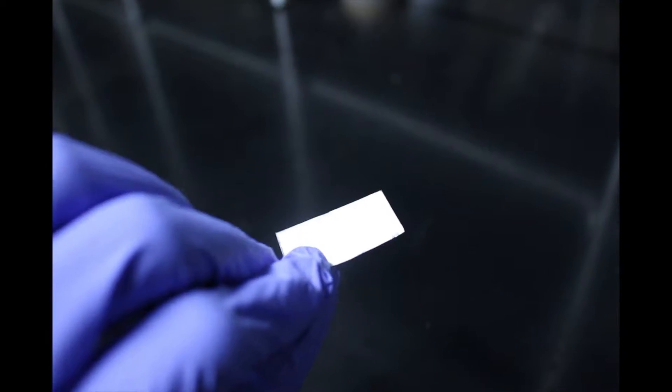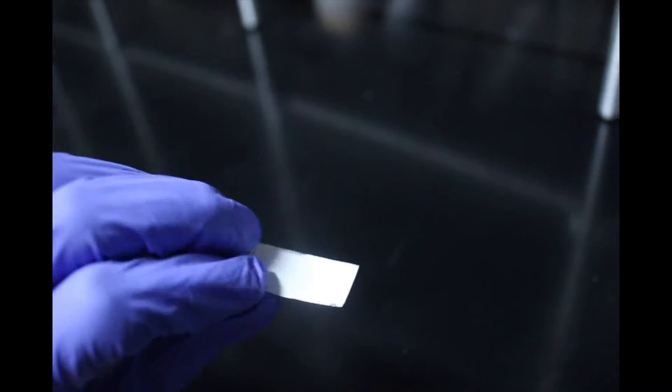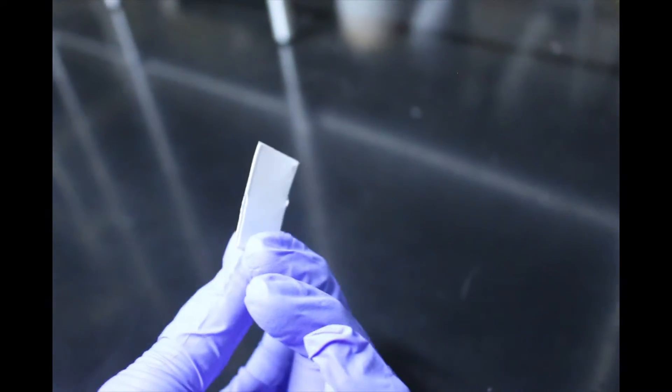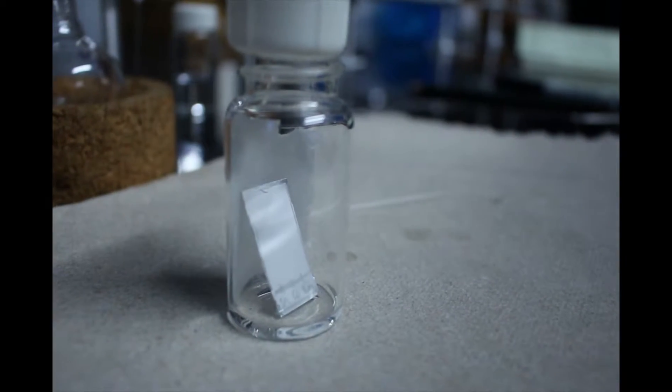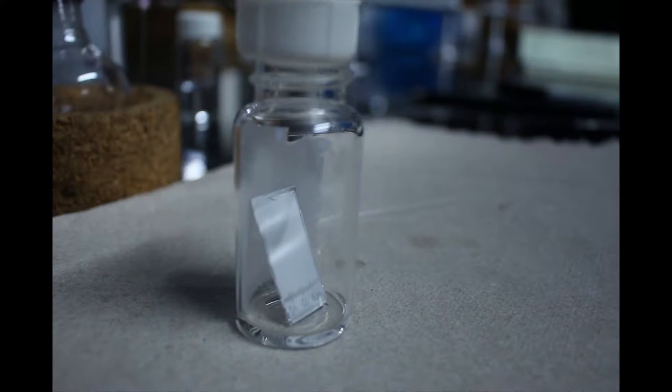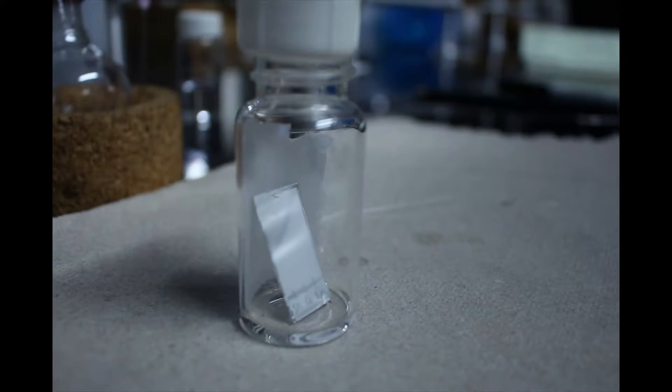In our lab, TLC is performed on a sheet of aluminum foil which is coated with a thin layer of adsorbent material called silica gel. The TLC plate is dipped into a solvent or combination of solvents called the mobile phase which carries the components up the plate based on polar interactions with both the mobile and the stationary phase.